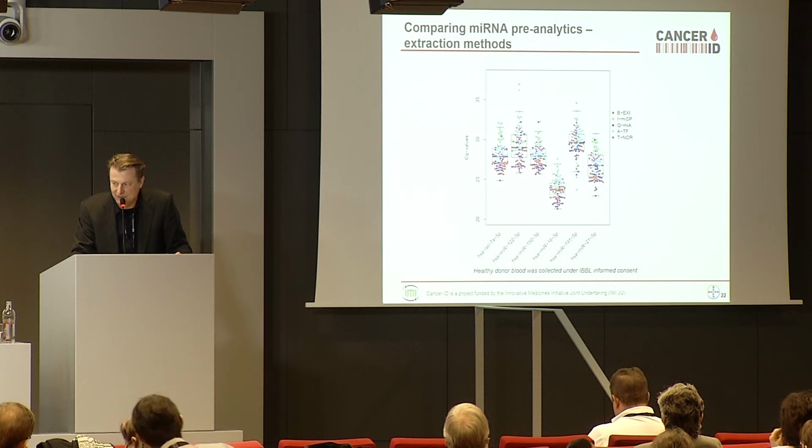And this is comparing different extraction protocols or technologies as well. So from Exiqon, QIAGEN, Norgen, etc. This is very colorful, so I like to show that.